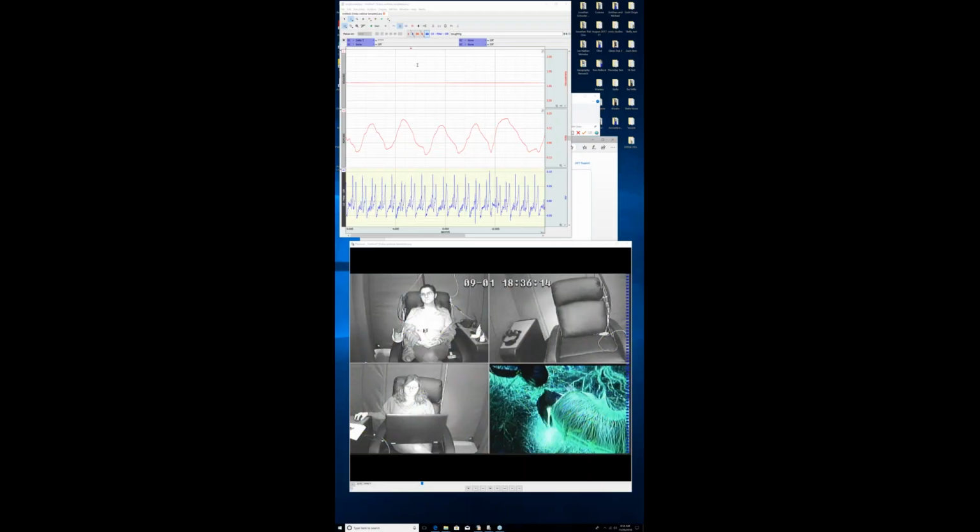Okay, so after I had entered the events, I'm going to use a little laser tool on here somewhere. Drawing tool. Let's use spotlight. Okay, so right here where I've got this red light, there's a little diamond, and this is called the global event bar. And I elected to place the event mark in the global event bar, but if I wanted to, I could have put it on one of the channels. It just makes more sense for those observational marks to be in the global event bar.